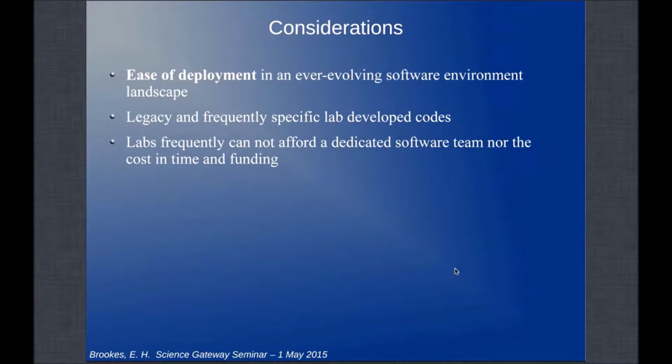Small angle scattering is a biological technique that's done at the lab with a benchtop or at synchrotrons, the giant particle accelerators, or neutron sources, in which they take a collimated beam of monochromatic light or neutrons and hit some particle in solution and get scattering information.